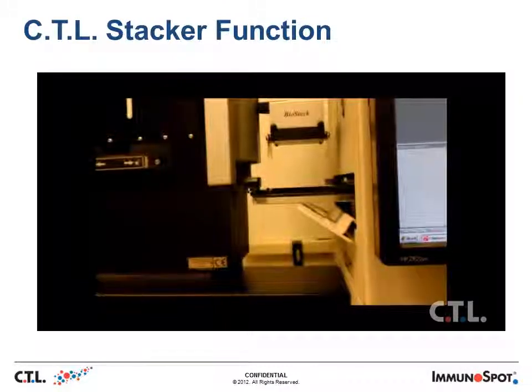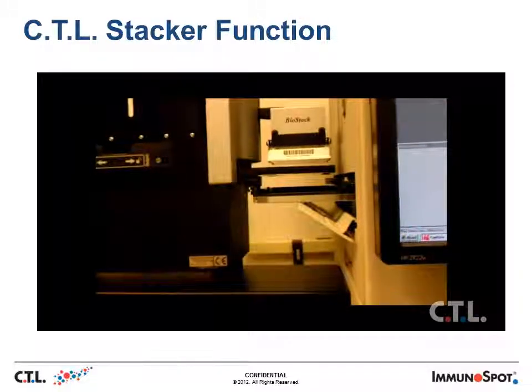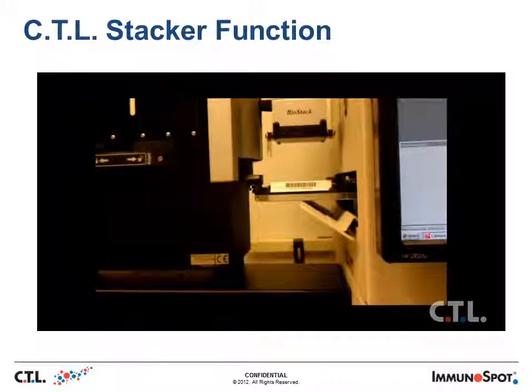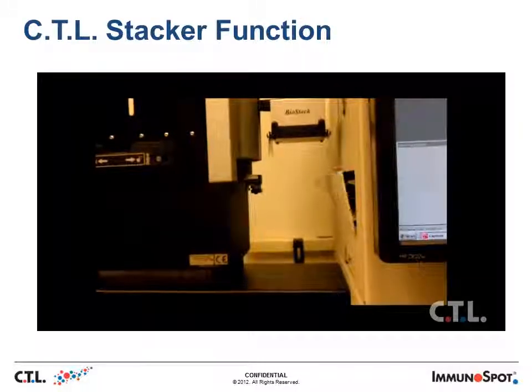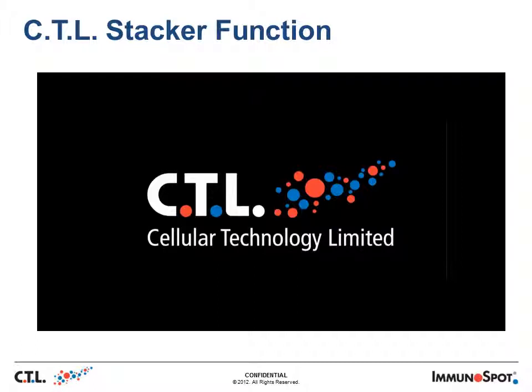At this point, the stacker then looks for the next plate and loads it onto the analyzer. The barcode on each of these plates is scanned and the data is associated with the barcode for easy access at a later time.